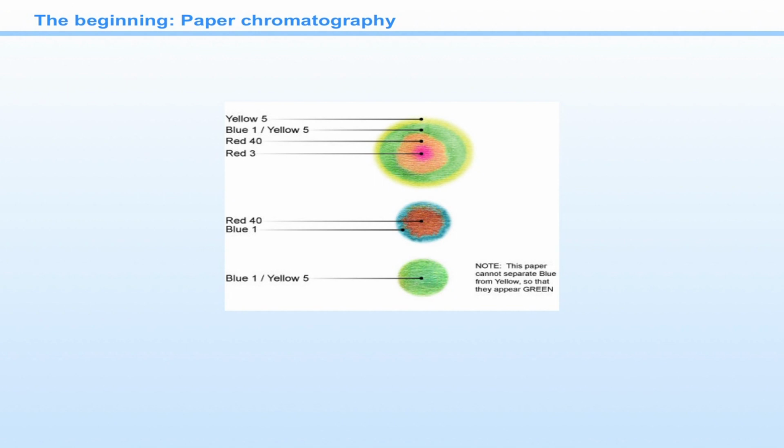For example, I am going to separate amino acids by using the paper chromatography technique. The direct method for visualizing the separated amino acid is by spraying ninhydrin. This ninhydrin interacts with the amino acid and shows a purple color spot, and you can see where our sample has been separated out. If it is the indirect method, you have to take a small beaker. To that beaker you add iodine, and you keep a filter paper in it for detecting the separation of the components. The beaker is closed with the lid. These iodine fumes interact with the sample and produce a brown colored compound. This is the indirect method.